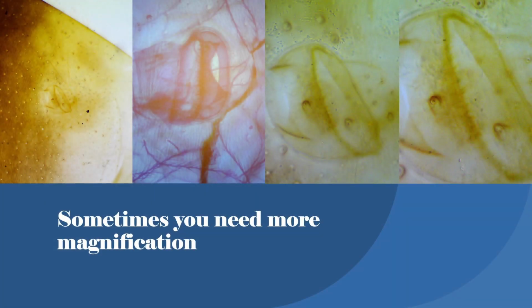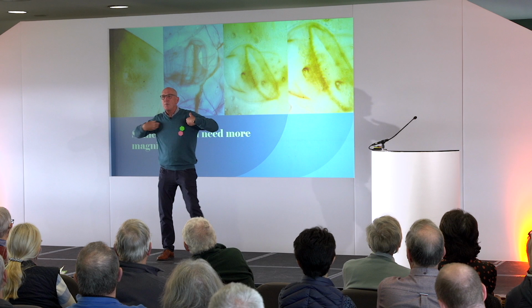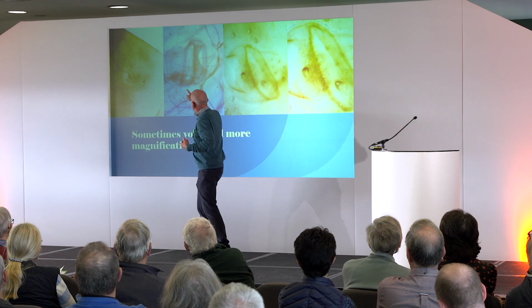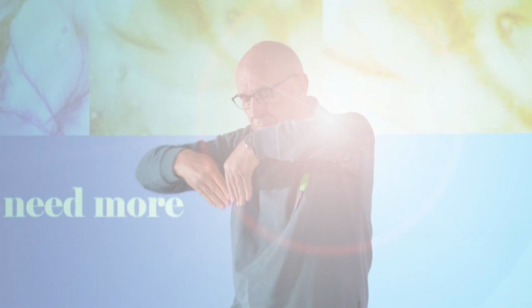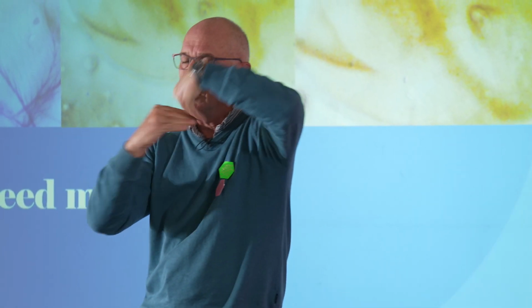That's the size of a spiracle. If you imagine, you can just make it out. This isn't of T1, T2, this is further down. So the first spiracle is directly connected to the trachea. This is one here. It's directly connected to the trachea, and the air comes in, and you can just see the hairs on there, which close off, and the acarine can just go through, particularly on young bees, because the hairs haven't developed and they're not hardened. They can go through.